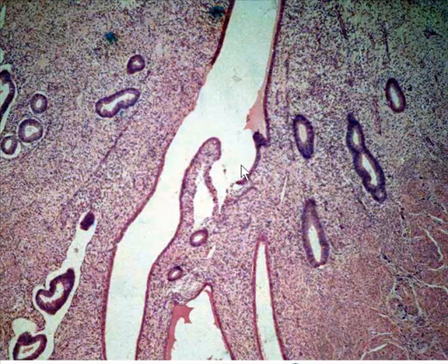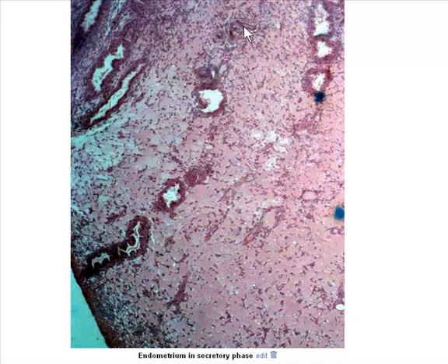But we also need to identify the phases. In order to identify the phase, kind of like the pre-ovulatory or post-ovulatory phases of the uterus, which is also called the proliferative and the secretory phase, depending on where you're from, with the uterine glands in the proliferative phase, they tend to look smooth, much like this one is. And when you look at them in the secretory phase, they have this kind of wavy border to them. Very well seen right here. Okay, so this is the secretory phase here.